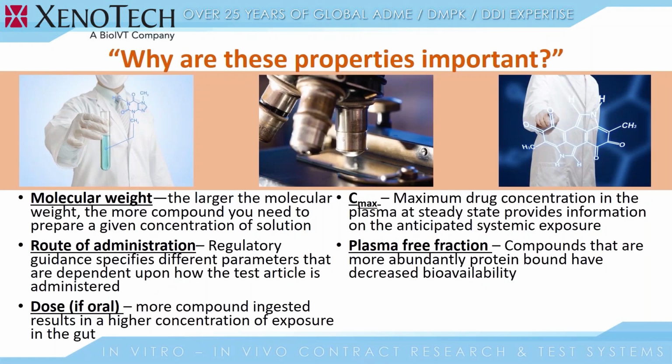Why are those properties in particular important? Well, obviously, for molecular weight, the larger the molecule is, the more compound that you need to prepare a given concentration of solution. So larger molecule, we need more compound. Smaller molecule, we need less compound.